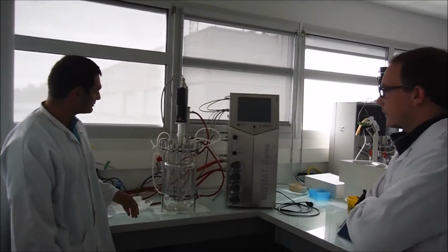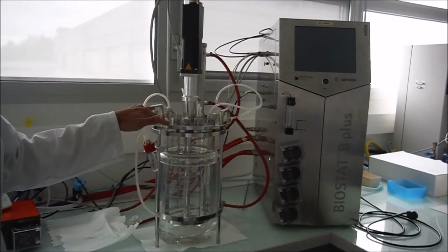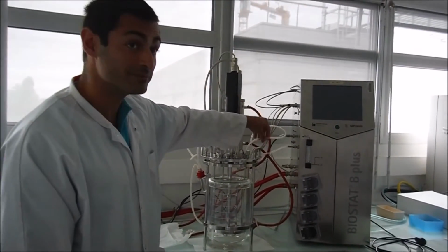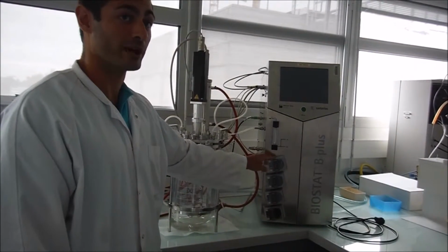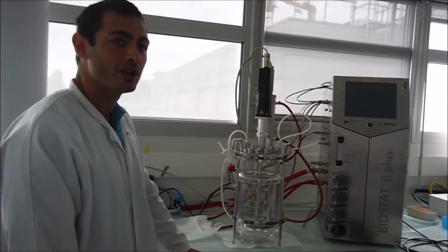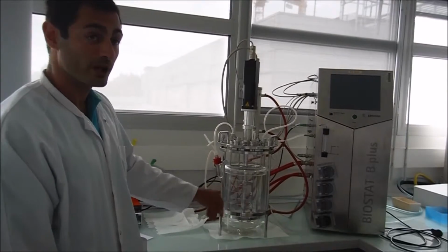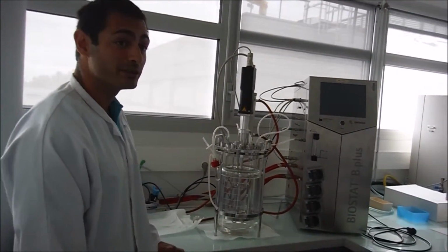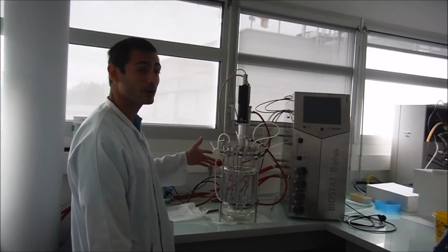You can find in this system the reactor tank, which will contain the culture and suspension, an agitation system, different pumps, a feeding pump, and 2 others for the addition of base or acid. Thermal jackets for the temperature control, an air supply system, and finally you can see there an entry and an exit for sampling or harvesting.